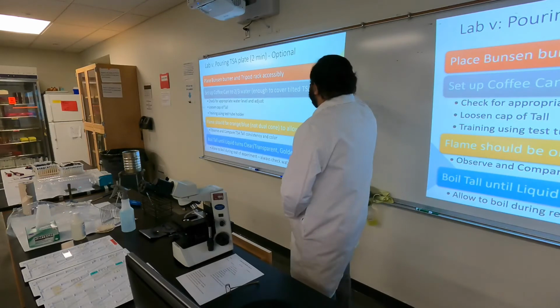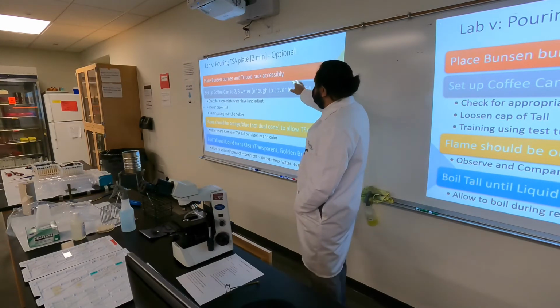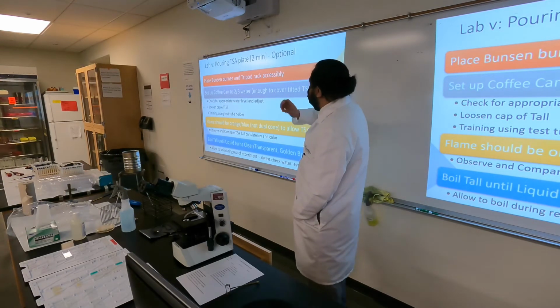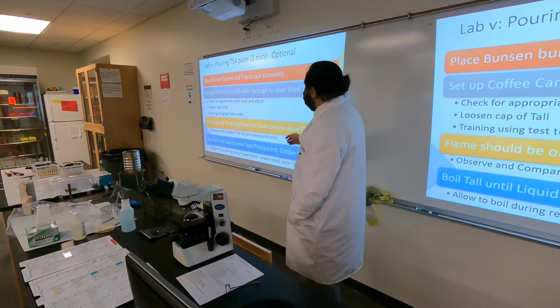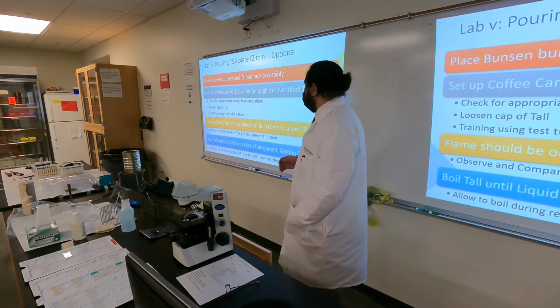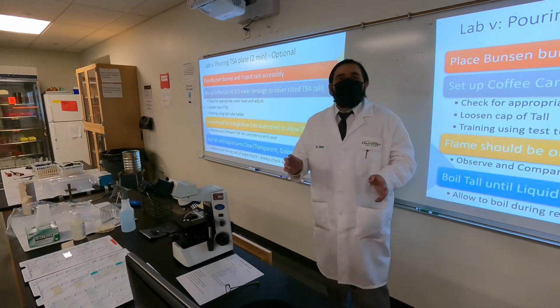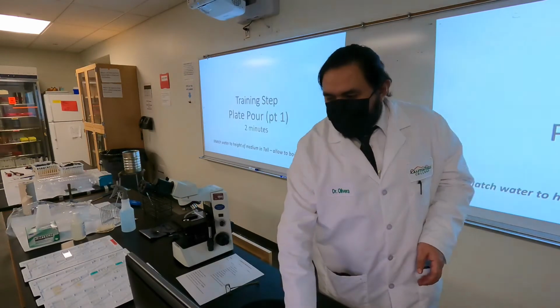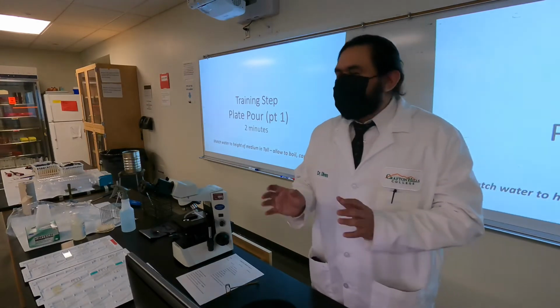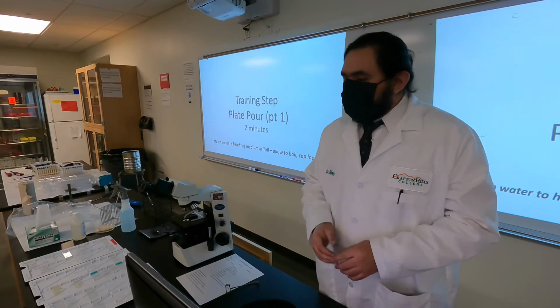Okay, so we set up our tripod, we set up our Bunsen burner between that orange to blue flame, so we can start boiling slowly. Again, we covered it enough, we made sure that the cap was loose, right? And then eventually, once you do part 2 of this, when we actually pour the plate, we'll train you how to use the test tube holder, which is also a good skill to know, all right? And so we're going to let this go until we finish with the scope for the moment. Everything we've done so far is basically the setup for the plate pouring. So we did our water, we did our boiling, we're going to let it sit there for a little bit, okay?